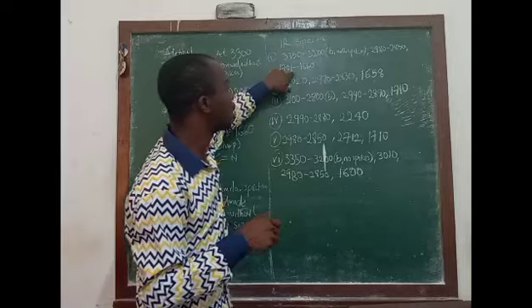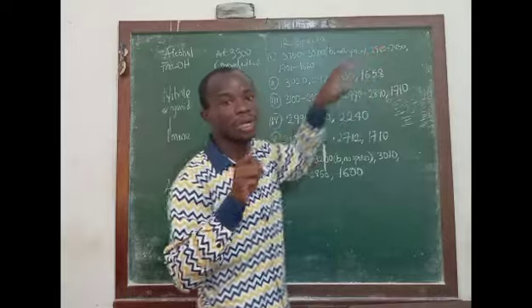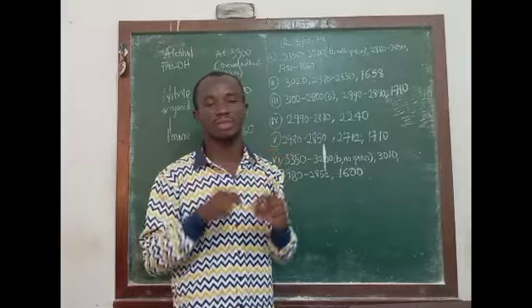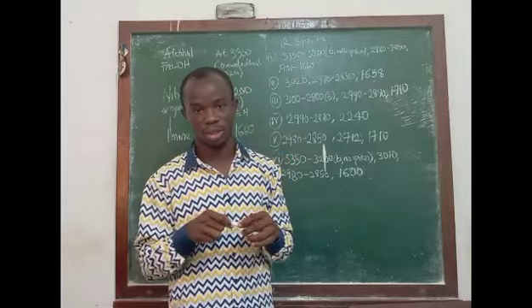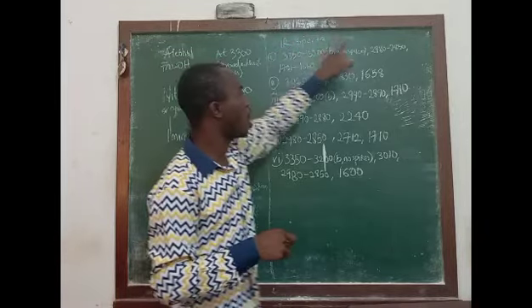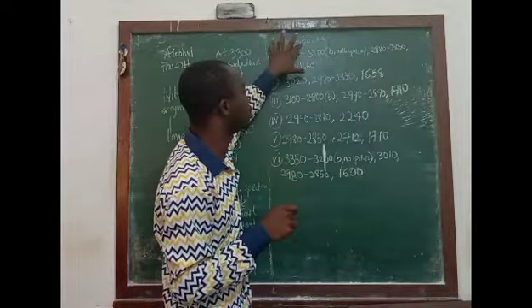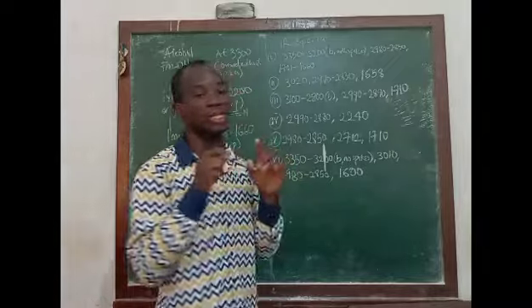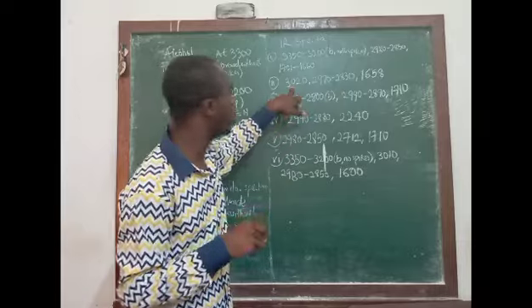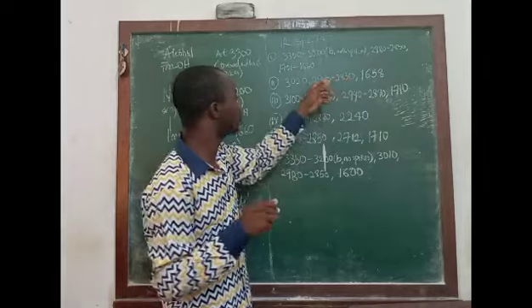So with carbonyl signal, NH2 and this signal for saturated carbons, we can conclude by saying that this spectrum represents a saturated amide compound, because it's having a carbonyl signal, it's having an NH2 stretching vibration, and it's having a signal just below 3,000. So the first spectrum that we are looking at here is a spectrum for a saturated amide compound.